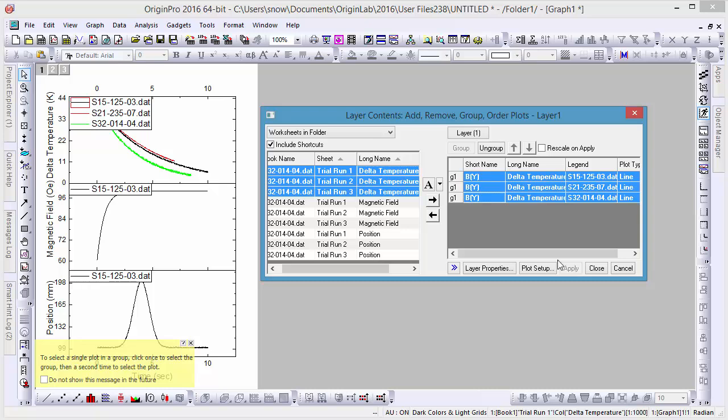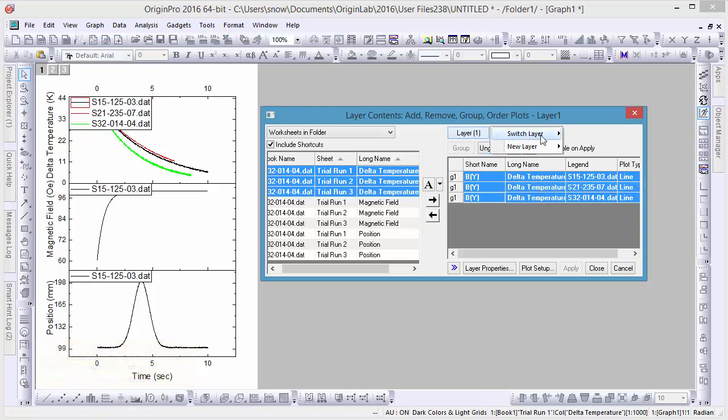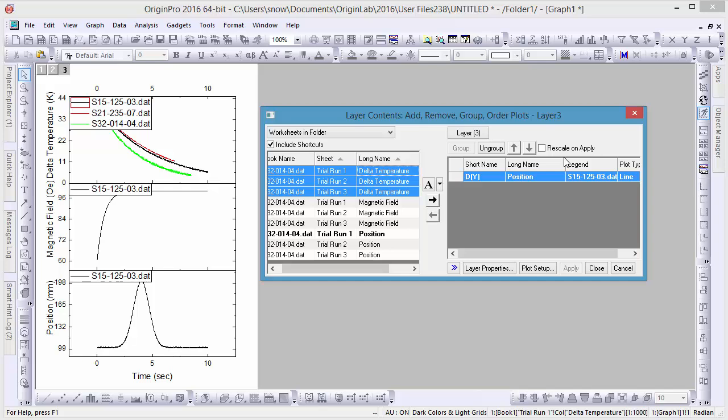To edit another panel of our graph, we need not close the Layer Content window. Rather, go to the top right side of the dialog to the button displaying our current layer name and then click on it to switch to Layer 3.